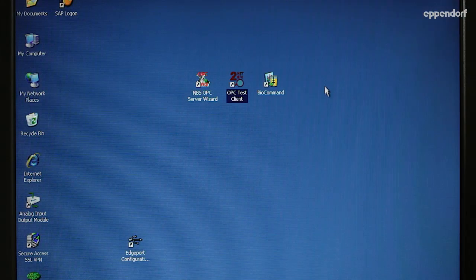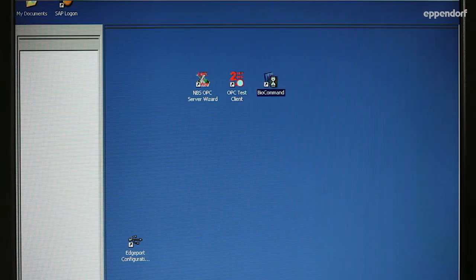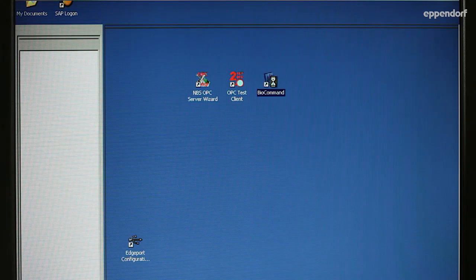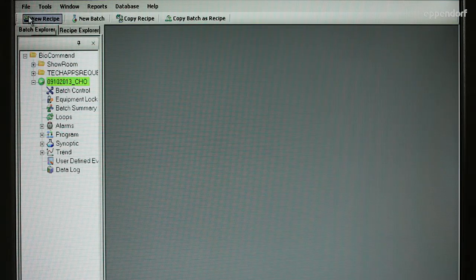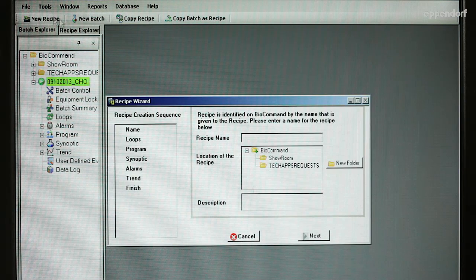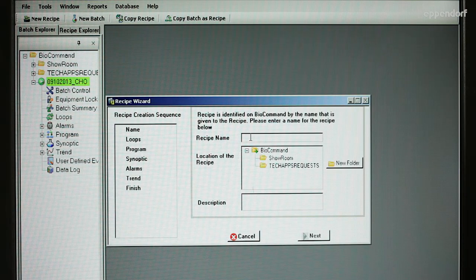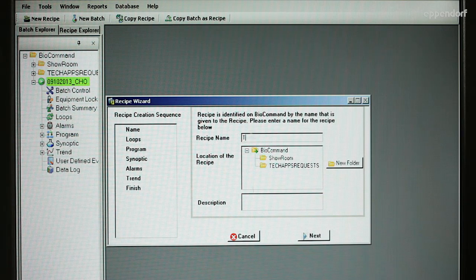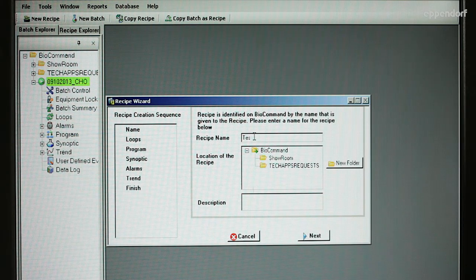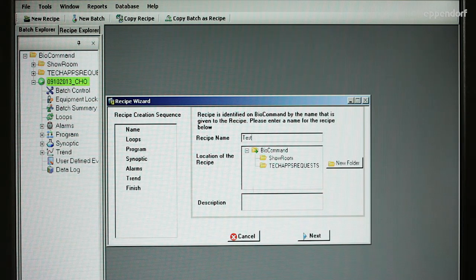To create a recipe, open BioCommand and then click on New Recipe. First, you will identify the new recipe with a name and you will select a folder in which to save it.